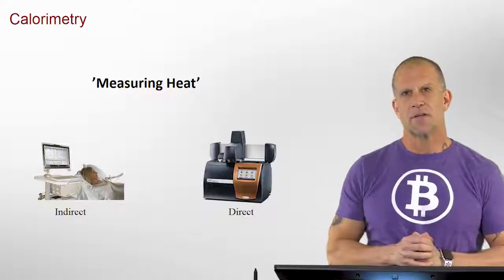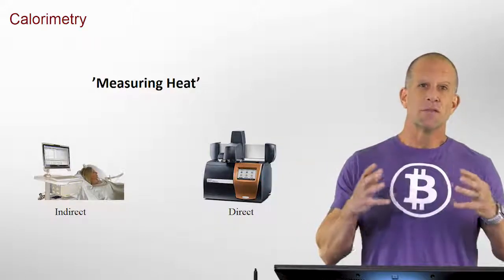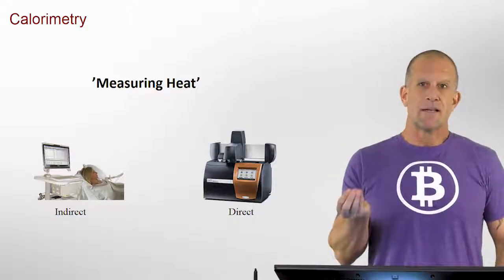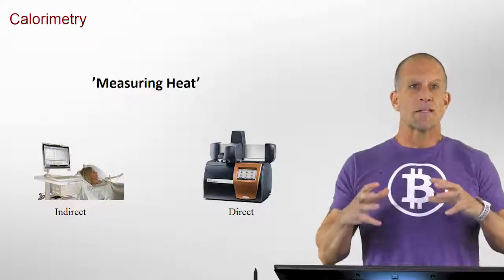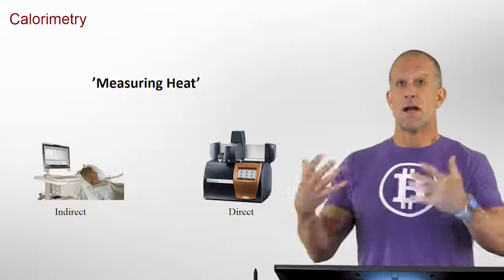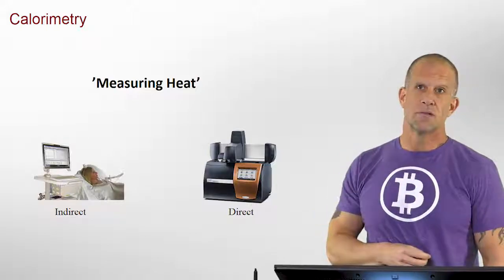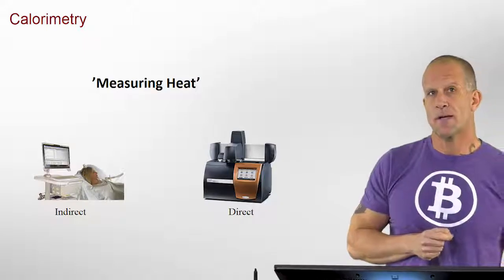So calorimetry is really measuring heat. And so most of the time, calorimetry is the primary experimental technique we use in getting a grasp experimentally on thermodynamics of chemical or biochemical systems. It's really at the heart of what we use experimentally to get at thermodynamic parameters.